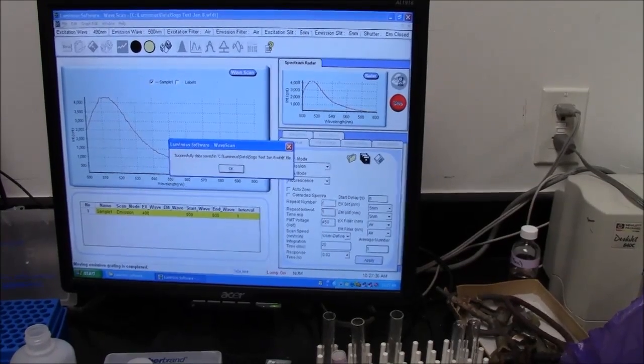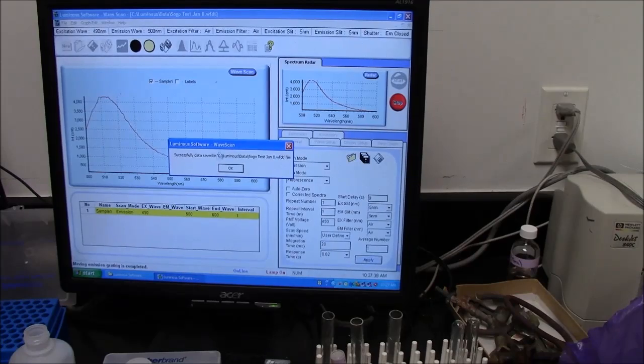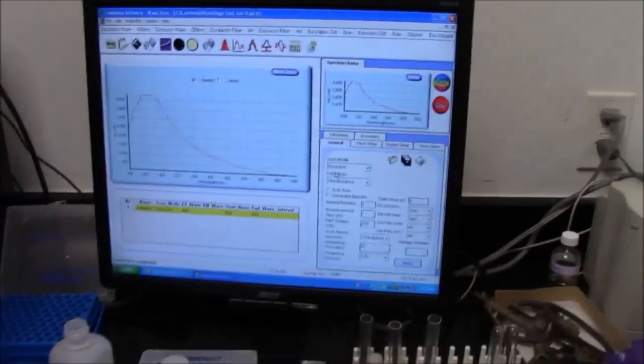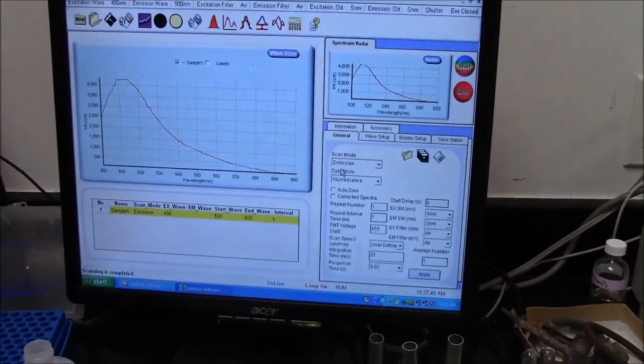So here it says the data has been saved, so I say okay, great, thank you for saving the data. So here's my fluorescence spectrum.